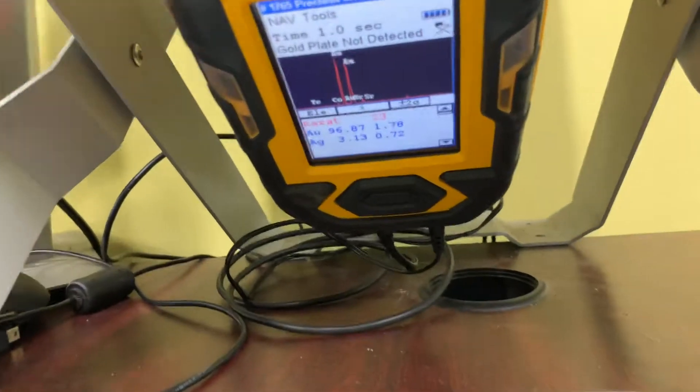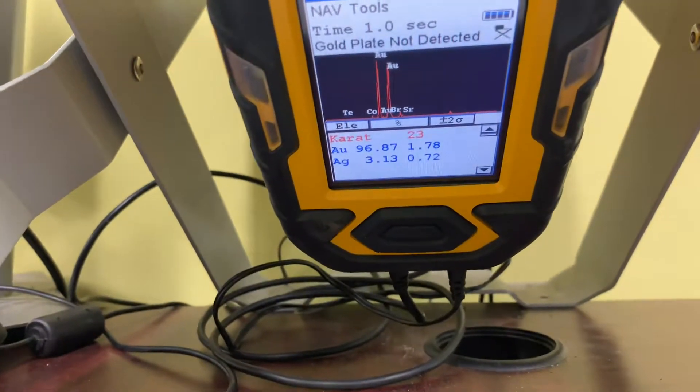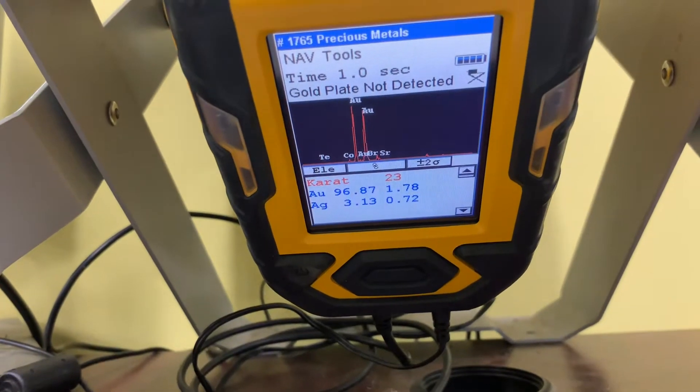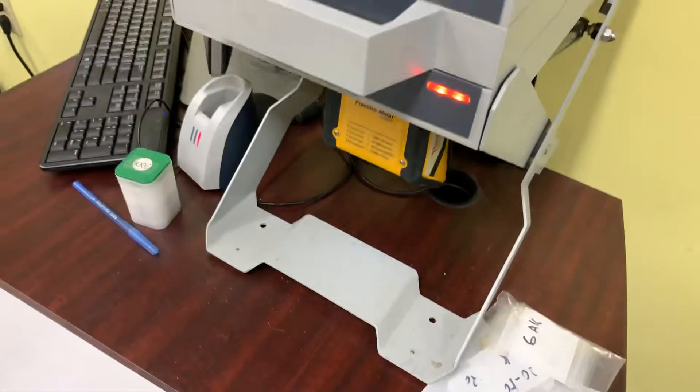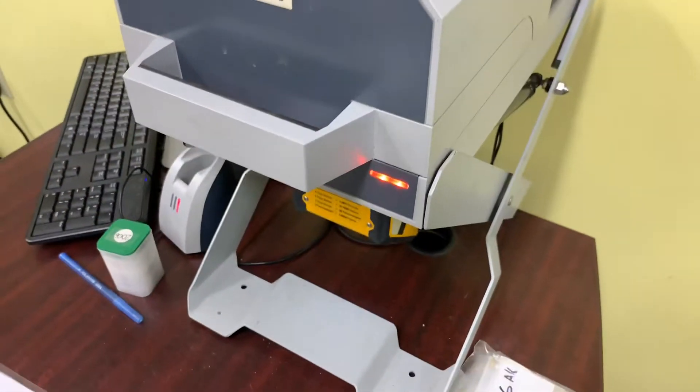23 carat, 96.87. That comes out to be 23 and a quarter carat.